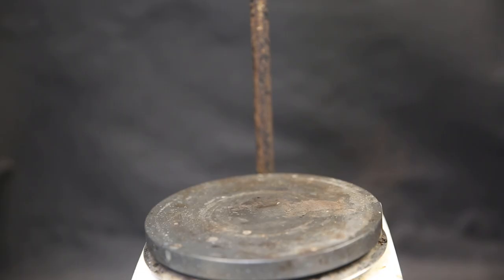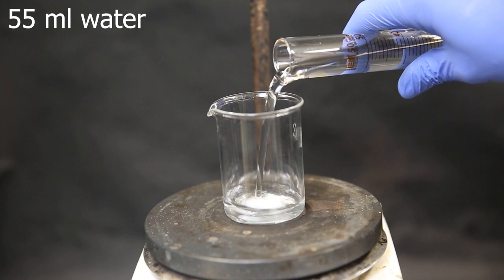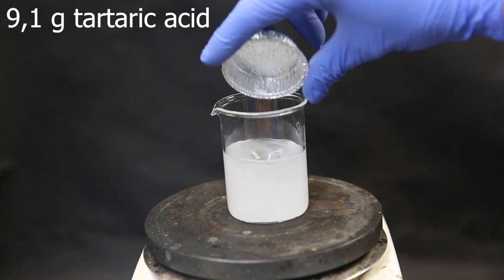When everything had reacted, I start preparing another solution. So I set up a new beaker, add in a stir bar and add in 55 mils of water. Then I add in 9.1g of tartaric acid. I allow everything to dissolve and then take it off. Now that this is prepared, we can start the reaction.